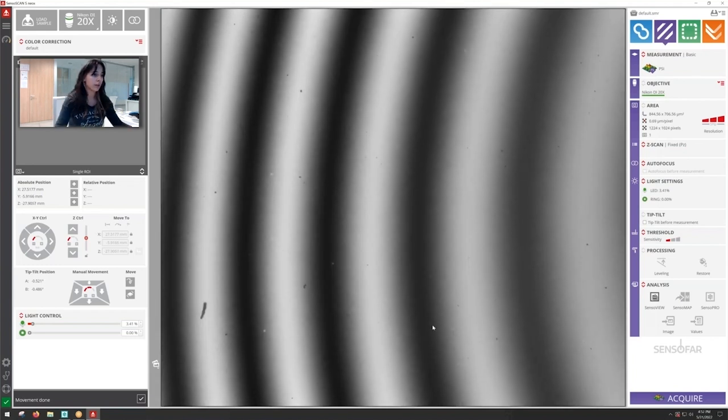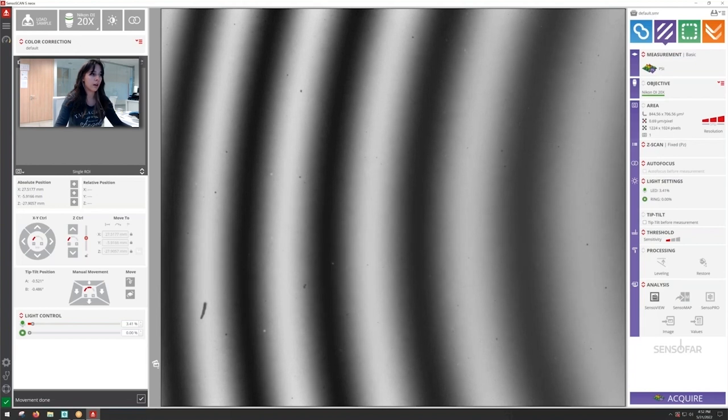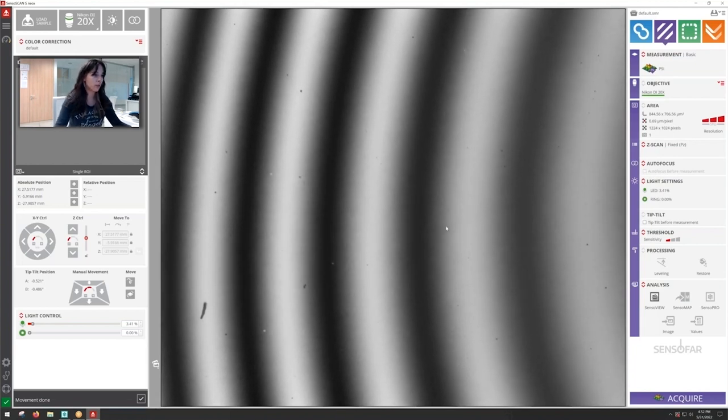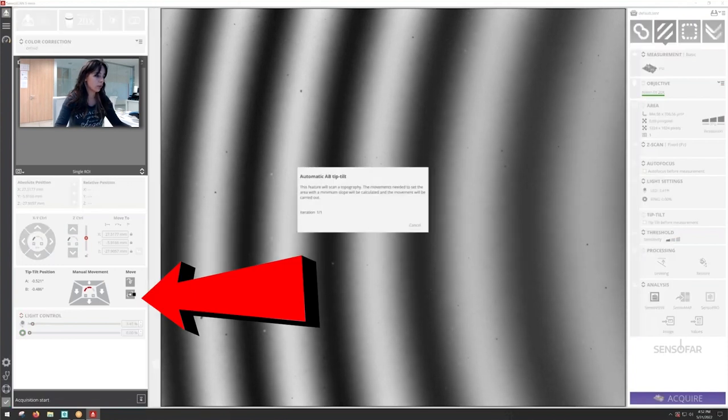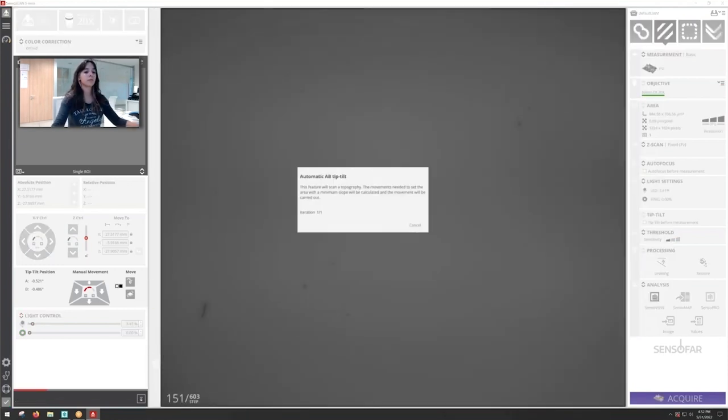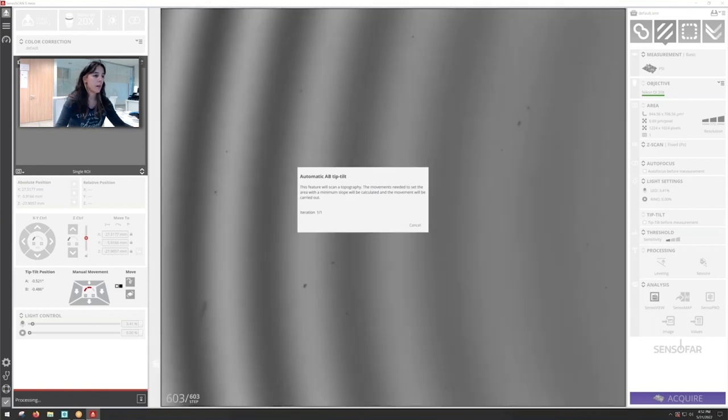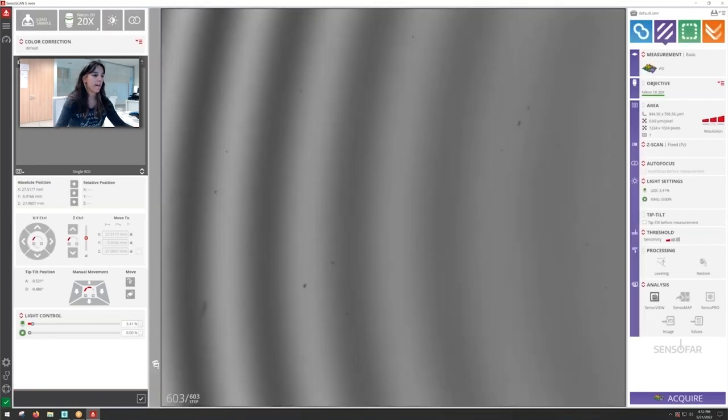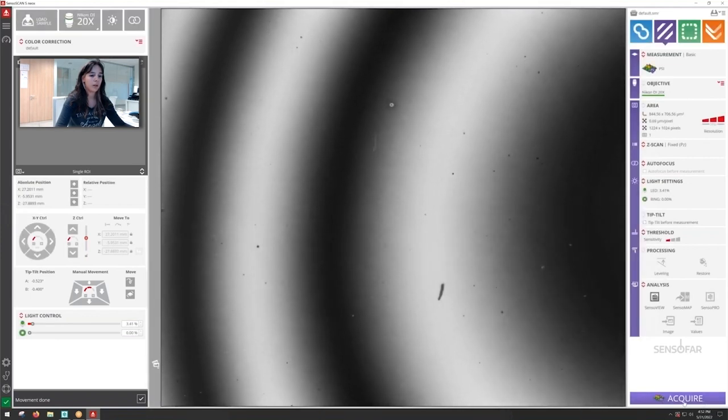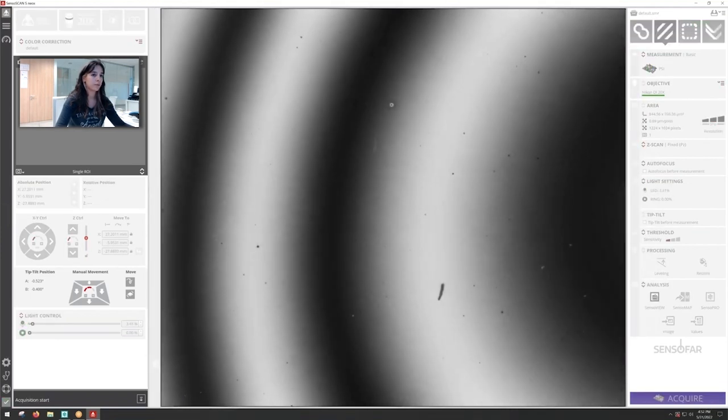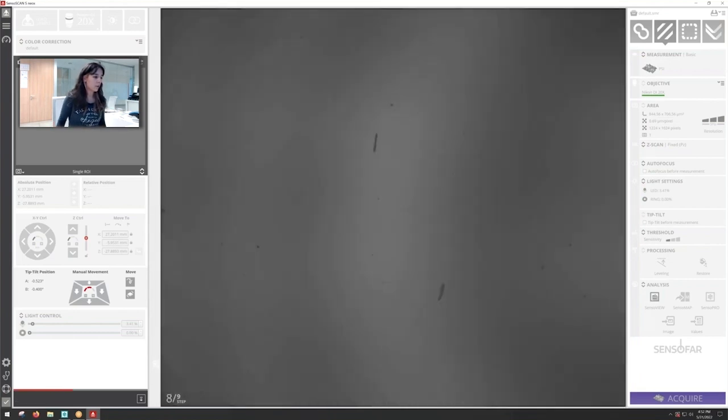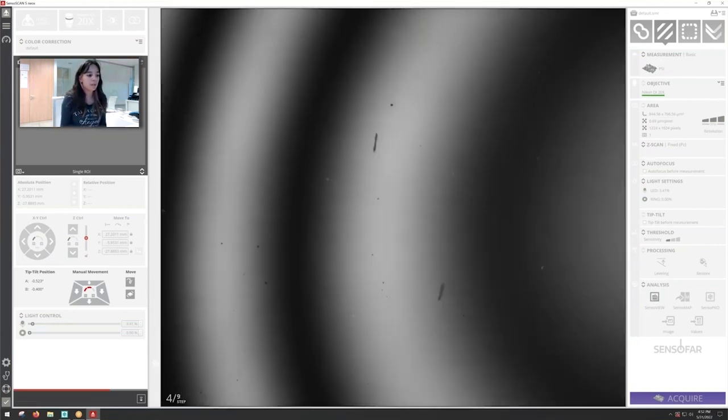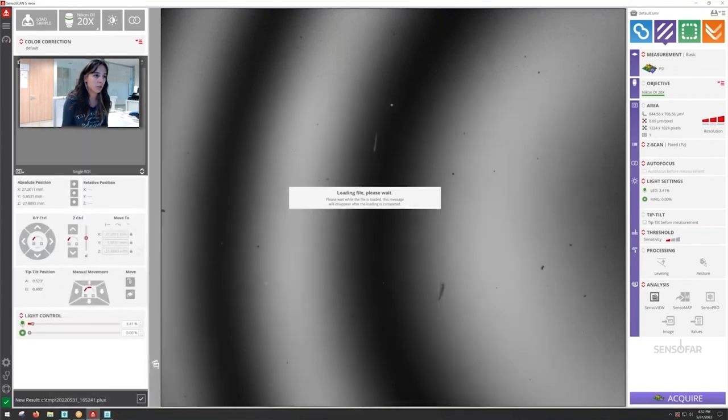So we can see that this surface is a little bit inclined so we're going to take out this inclination to make sure that the range of phase shifting interferometry is going to work out. So let's do an auto-tip tilt. And now we can go ahead and acquire.